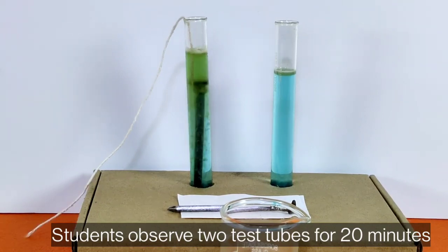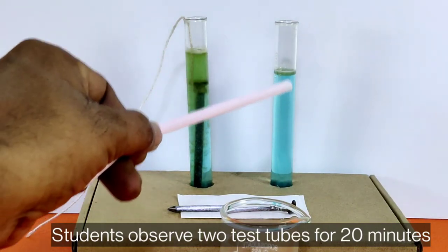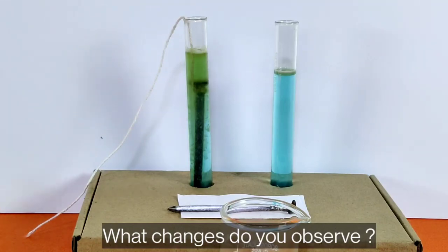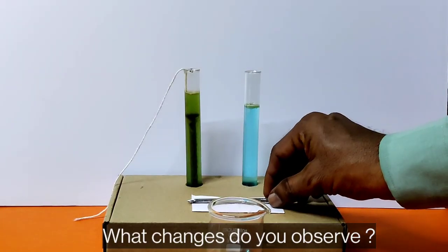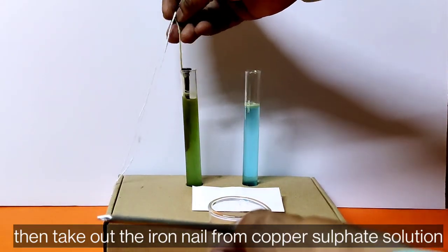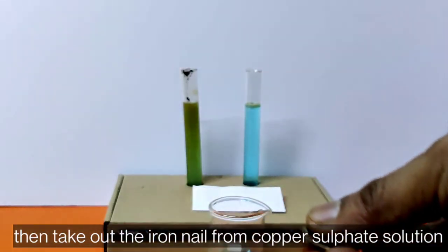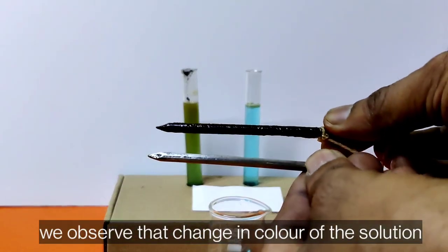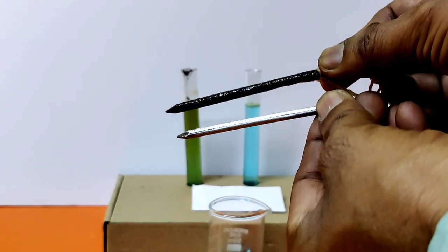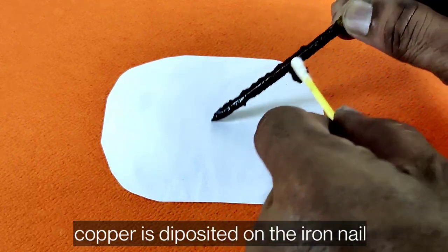Students, observe the two test tubes for 20 minutes. What changes do you observe? Then take the iron nail out from the copper sulfate solution. We observe a change in color of the solution and copper deposited on the iron nail.